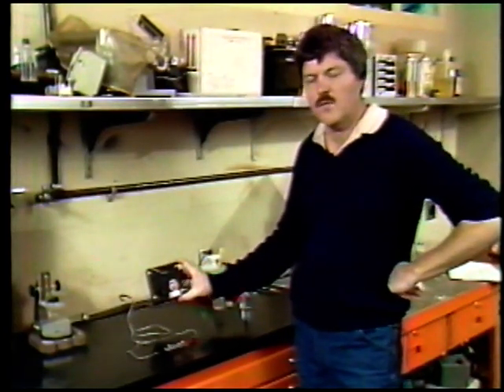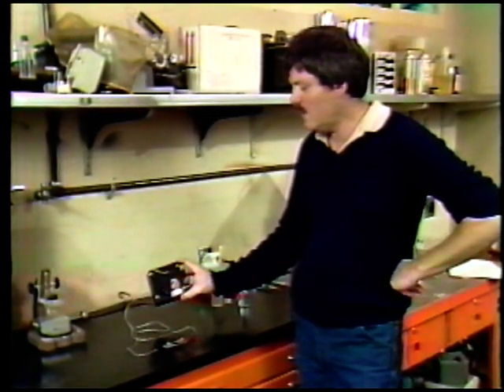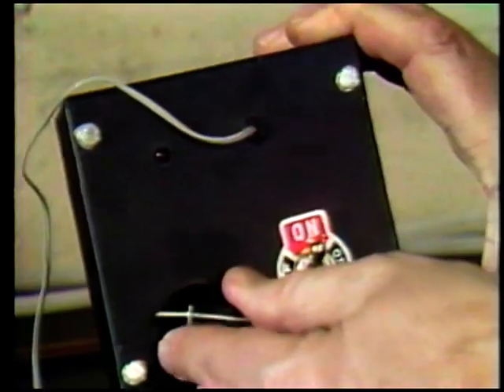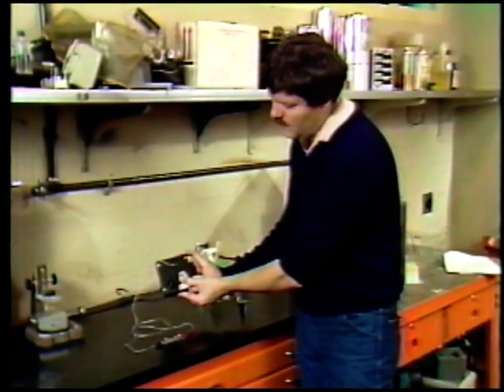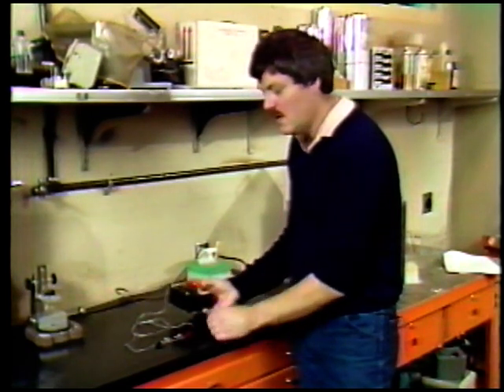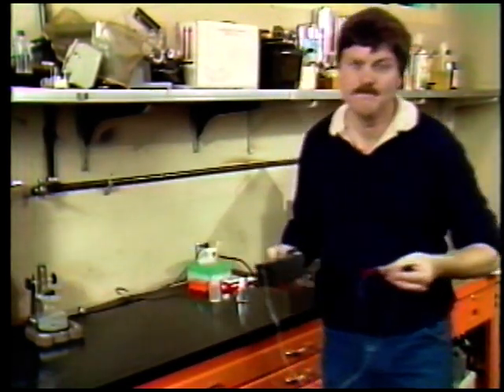This is my electrophoresis power supply, which contains 3 9-volt transistor batteries hooked in series and a selector switch, and this switch which makes the voltage go forward and reverse. Let's take it with us now to the microscope, which is in another room. Here we are in the microscope room.